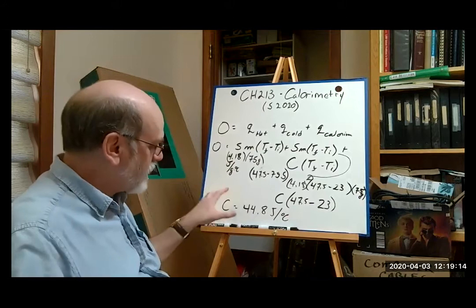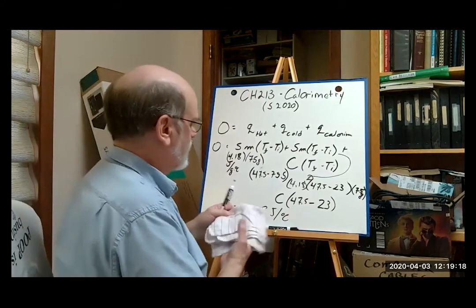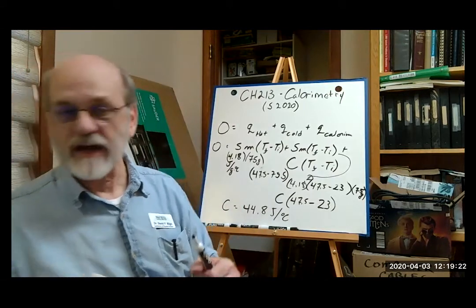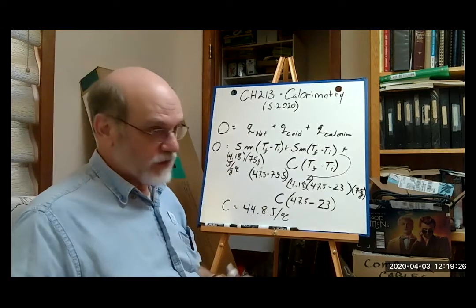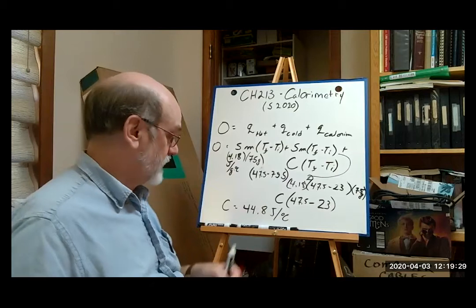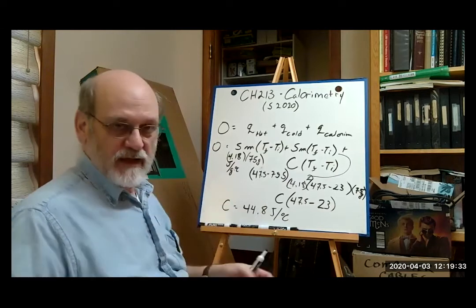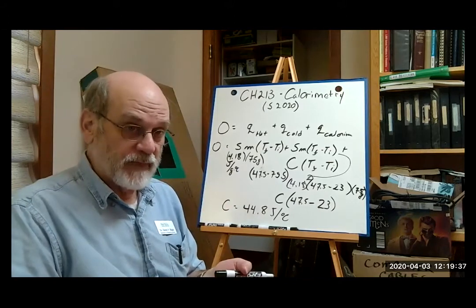All right, so now we've calculated our calorimeter constant. And remember, when we say it's constant, it does not change.